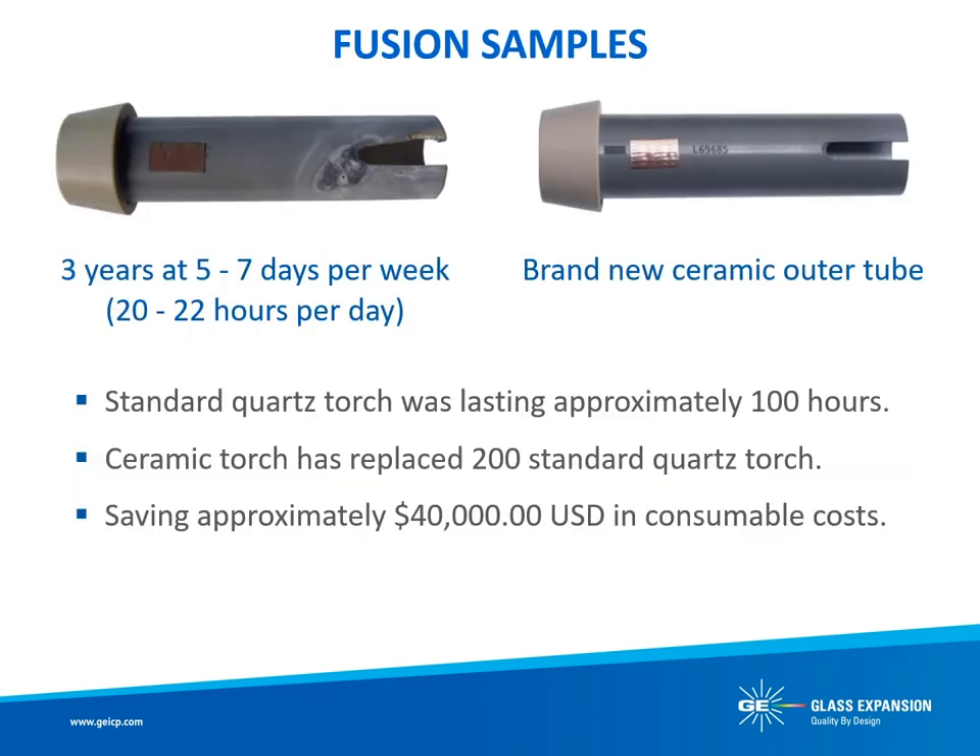The ceramic outer tube is of particular benefit for fusion samples, which cause quartz tubes to rapidly de-vitrify. The D-Torch ceramic outer tube shown on the left has been running lithium borate fusion samples for 3 years, at 5 to 7 days per week and 20 to 22 hours per day. The ceramic outer tube is showing clear signs of wear and tear, but has been running very demanding samples for approximately 20,000 hours, and at the time this photo was taken it was still operational. As a comparison, before the D-Torch was installed, a standard quartz torch was lasting only about 100 hours for this laboratory. So the ceramic torch has outlasted 200 standard quartz torches, saving the laboratory at least $40,000 USD.